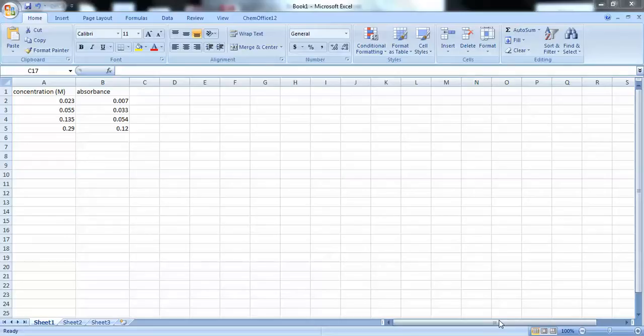Hey guys, here's a quick tutorial on how to make your scatter plots for your Beer's Law Lab.